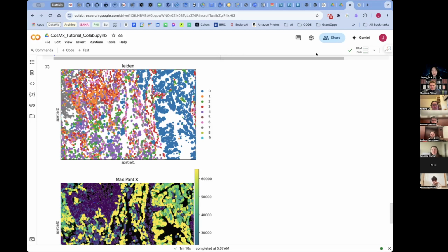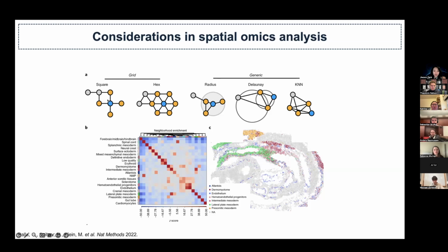We also tend to define grids in squares or hexagons. Hexagons are more common in the Visium platform. The rest of the platforms are mostly covered with squares. Instead of plain XY coordinates, you're still in XY coordinates but forming a hexagon format so that we can understand the interactions between the spots better, especially if you want to do spot-based sequencing technologies.